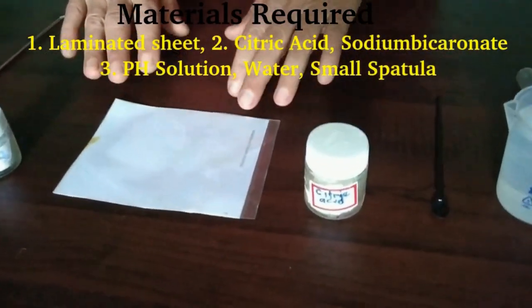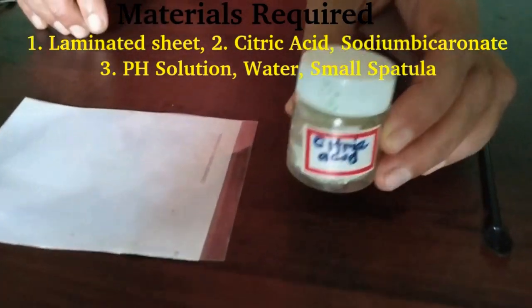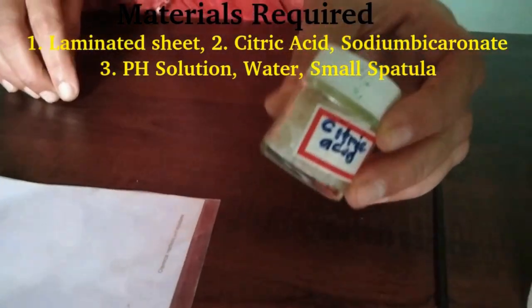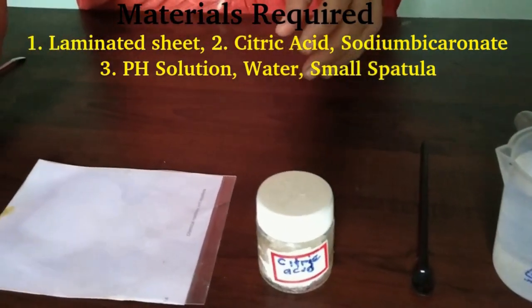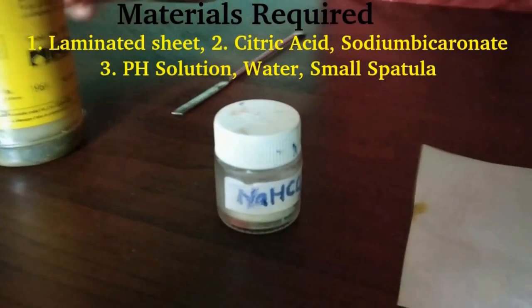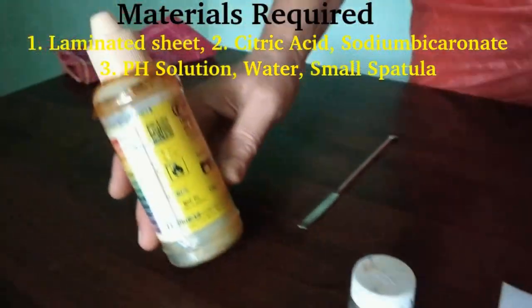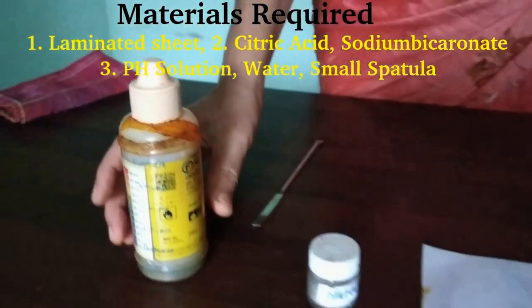So for this neutralization reaction, the materials that I have taken are the commonly available ones at home: sodium bicarbonate, that is baking soda, citric acid that we use in the kitchen as a preservative, and of course pH solution, which we'll have to buy from scientific supplies. If we do this, we'll be able to do this experiment.